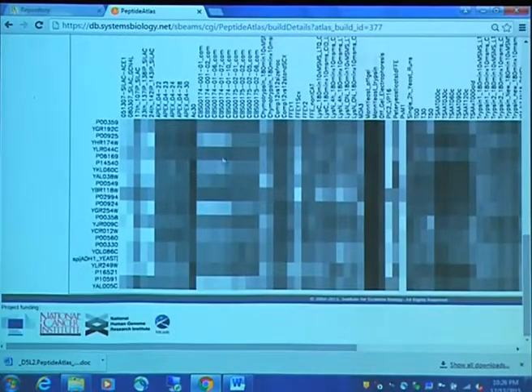And as I showed you also, down at the bottom there's a heat map that shows the different peptide accessions across the different experiments. And one thing that you can see here, you see this streak of really dark information. So this is from the Matthias Mann yeast data set, which is very large, and so it turns out that that was a big contributor to the atlas. Okay, so I'm going to go back to the top.